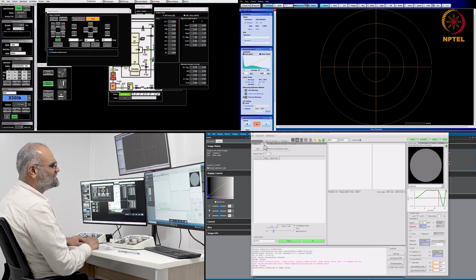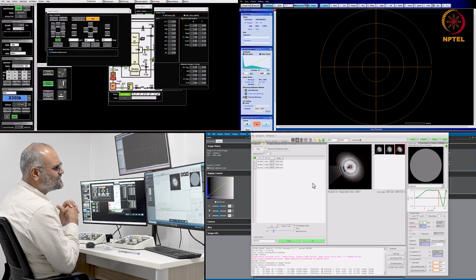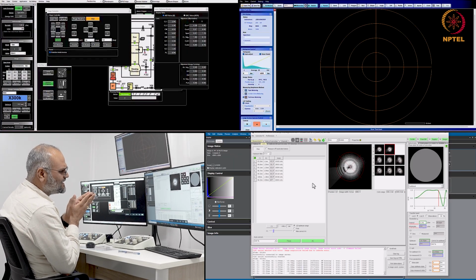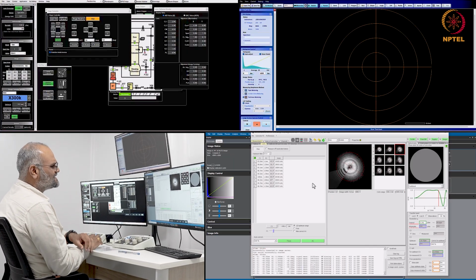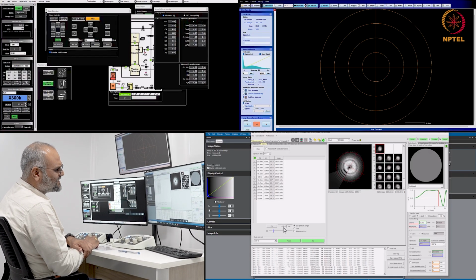So when I click on start C1A1, either by pressing this or here, I'm now recording a series of diffractograms, and usually there is a confidence value, and you can see that the C1 that is set here, half of the optimum range, is around minus 140.6, and the A1 is typically around 1 or less than 1 nanometer.